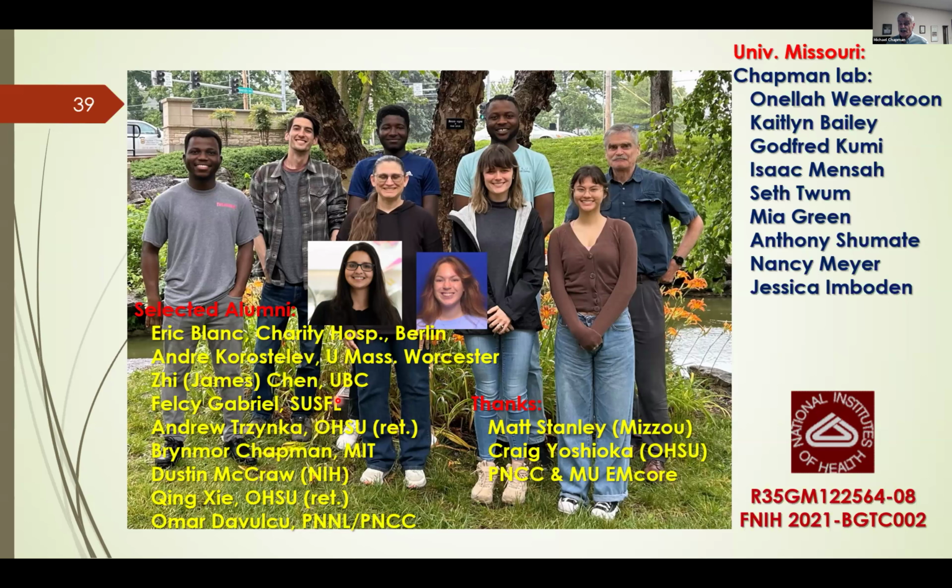But in terms of SPA, we really haven't done it. And when we did the focused classification, effectively, we've got 30-fold symmetry rather than 60-fold. I say that. Yeah, I guess that's true. It's effectively 30-fold symmetry instead of 60.